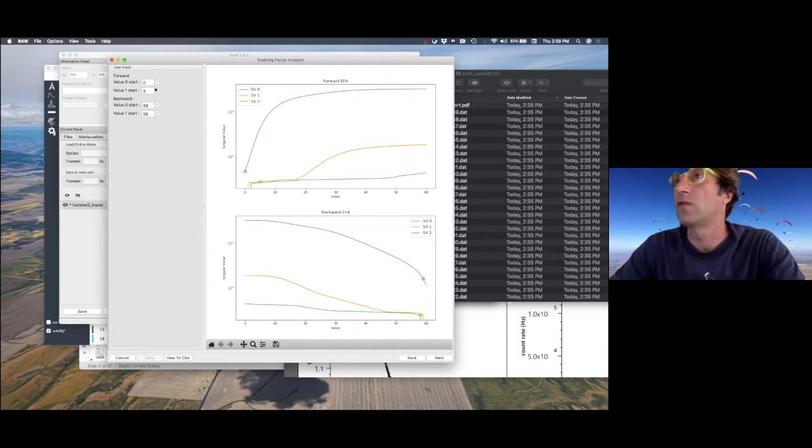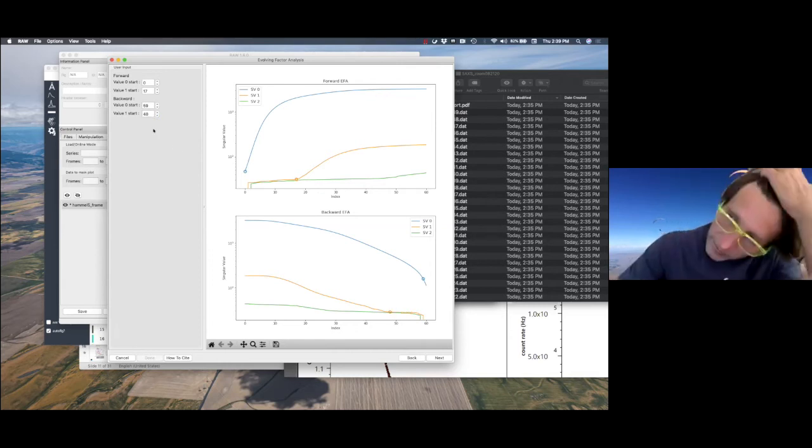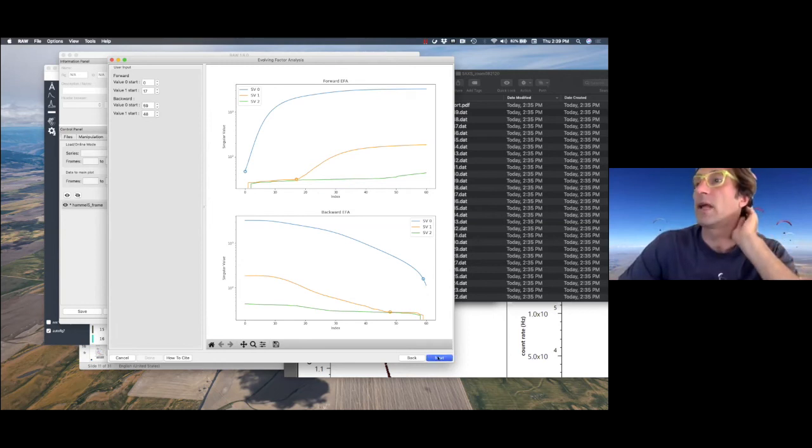And so in this case, we need to help him a little bit. We know the background is the green one. That's component number 3, which is not significant, and it also ends somewhere, so probably here. It's just a little help from the friend. And then we click the next button.